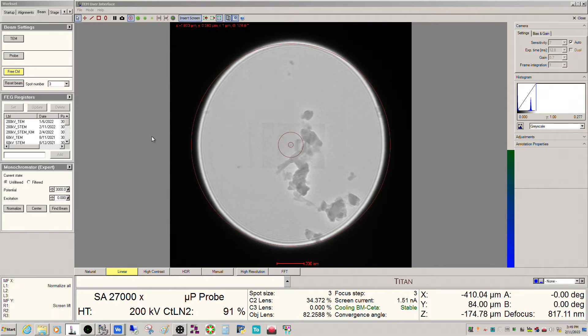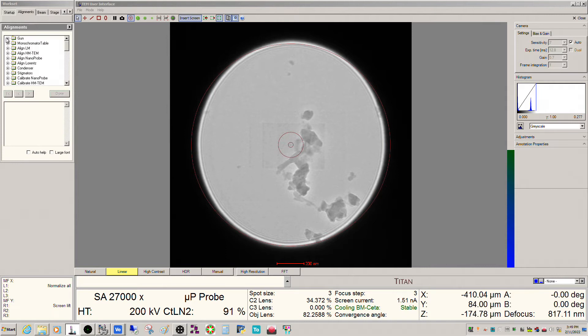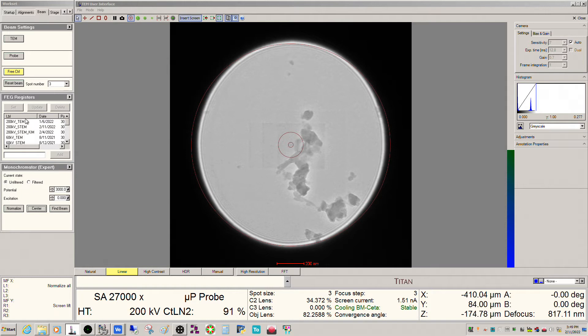I went to the beam settings and I have my C3 lens off. When you're doing your monochromator and gun adjustments, you want to be in this configuration — you want your C3 lens off to make it easier. If we go to this alignments tab, there's a bunch of alignments you can do for the gun, but in your day-to-day operation this really isn't necessary. You can do these once and then bury them in a FEG register, which is what I normally do.